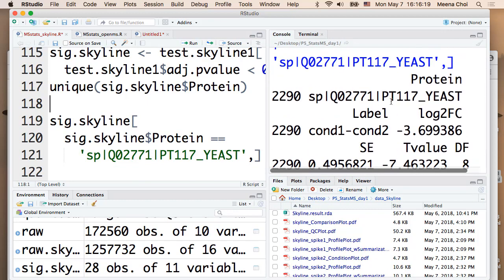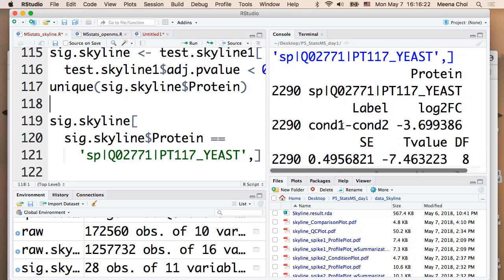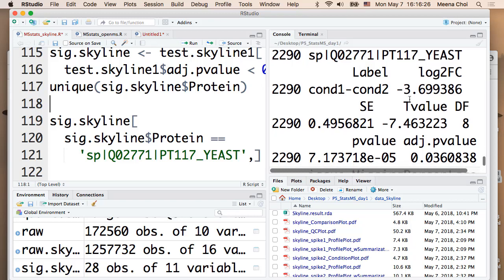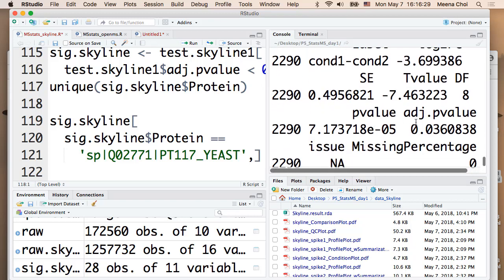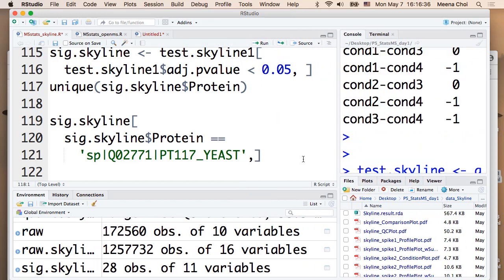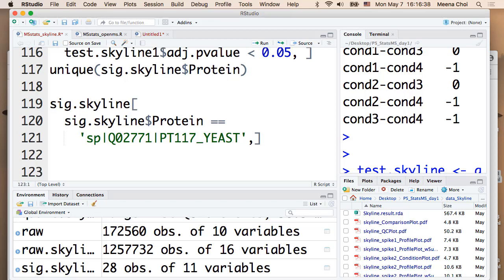So here for these proteins, for condition 1 versus condition 2, yes, actually they have a huge difference. And the p-value is also less than 0.05 and so on. Then commonly what I do, I just go back to the profile plot and check these proteins and then manually see whether this is correct or not. So this is what I do to double check for group comparisons. Is it okay so far for the group comparison part?